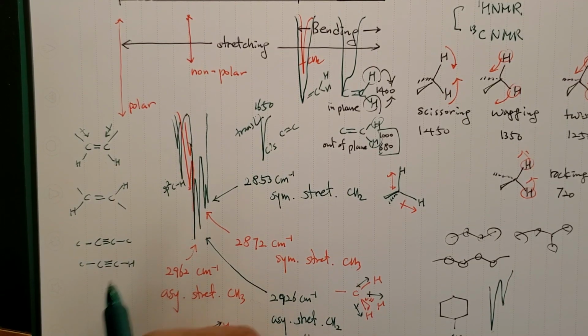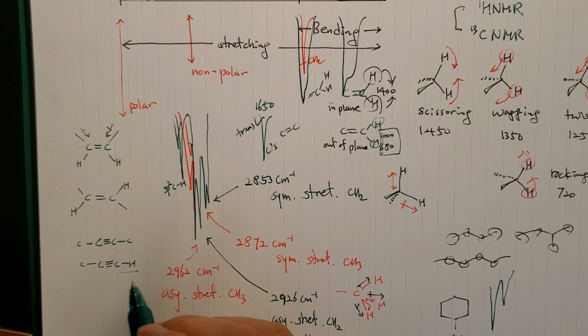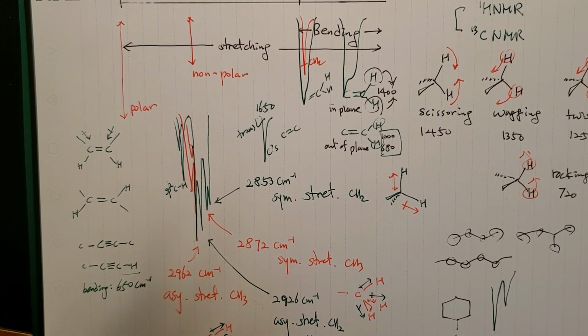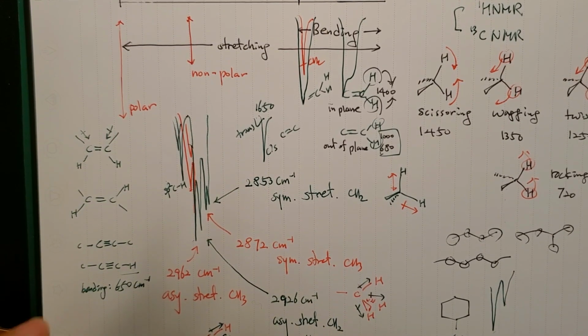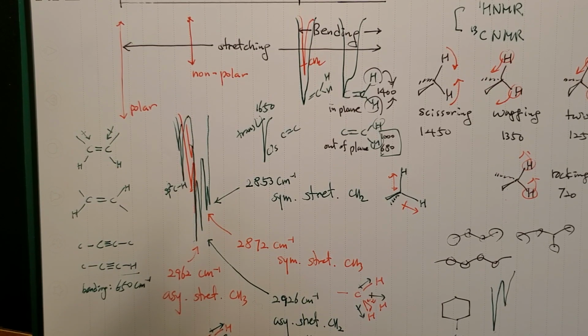So normally the bending vibration of the CH comes in a very small number, like 600, okay? 600 something, bending. And surprisingly very fat and big, like these. And you can easily get confused with the C-Br or C-Cl kind of size and fatness of the peak.